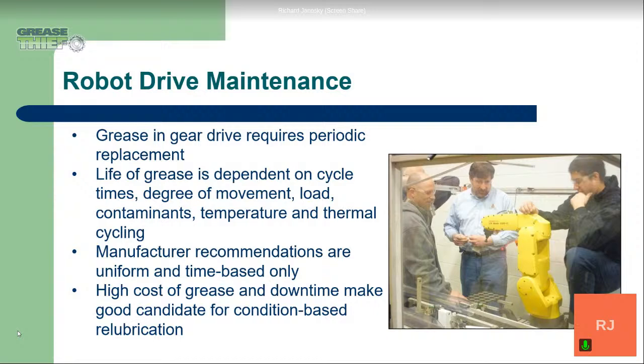Manufacturer recommendations are typically time-based, and it's similar to a change out for oil. They want you every so often to put in the new grease, removing that old grease, and it can be very costly to be putting in an expensive grease, especially if that grease has remaining useful life in it, and we're able to show that through data through grease analysis.